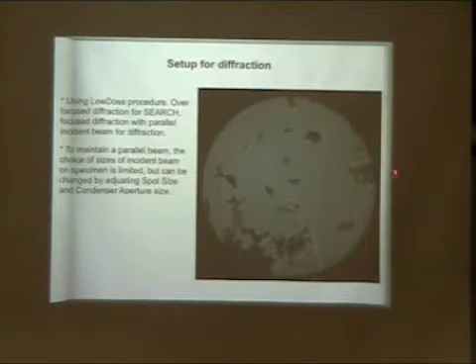And then, but this is in a search mode, in overfocus search mode. You can see all the crystal, and also using a very weak beam, you can find your crystal and do the diffraction. Now, to do the diffraction, there are a number of things you need to consider here. One thing is that you want to try to make your beam parallel, and we will mention later on why it is important to be as parallel as possible, so your spots can be very sharp.